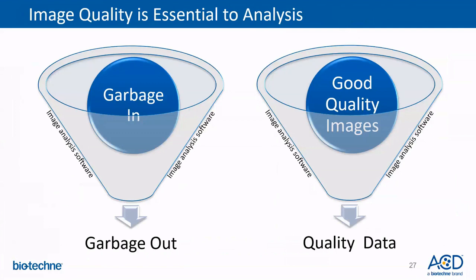Importantly, if we start with a bad image data set, we should not expect to get good data out of the analysis. As is the saying in image analysis, garbage in equals garbage out, and you can expect much higher quality data from good quality images.